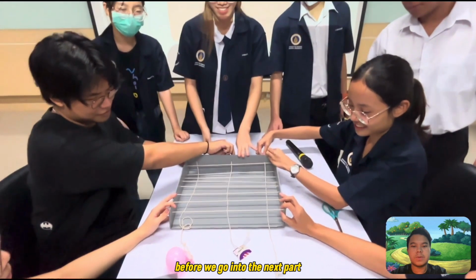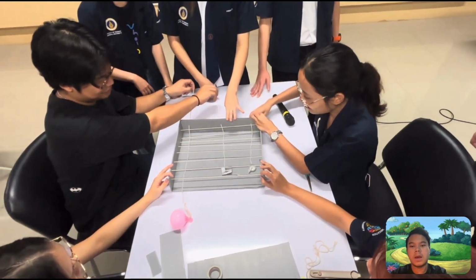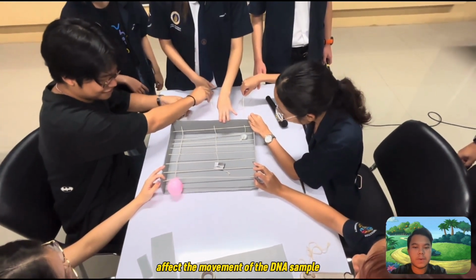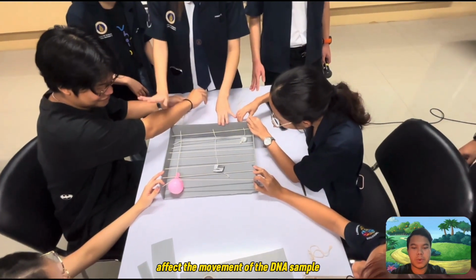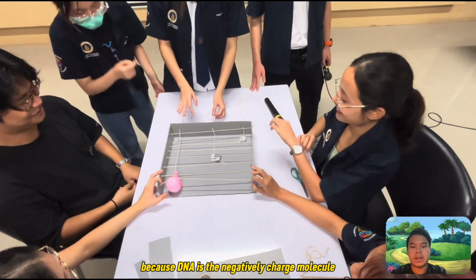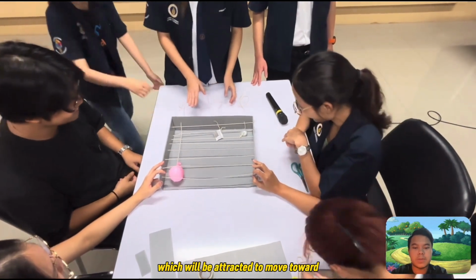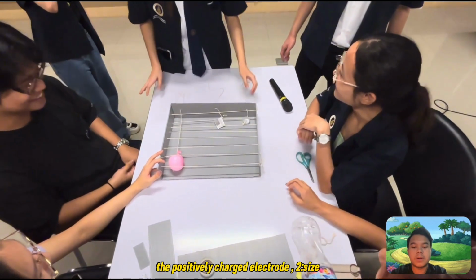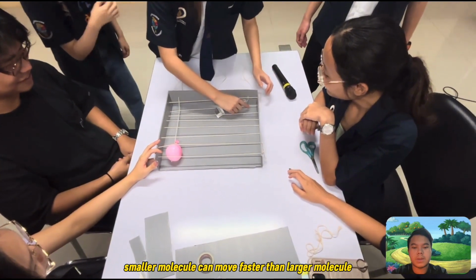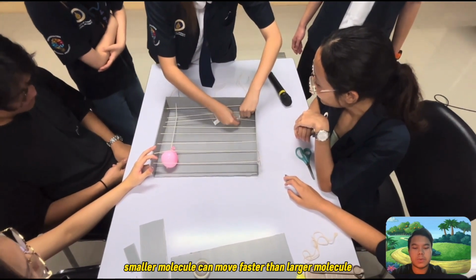Before we go into the next part, we want to sum up a little bit. In gel electrophoresis, there are 2 main factors that affect the movement of the DNA sample. These are: 1. Charge, because DNA is a negatively charged molecule, which will be attracted to move toward the positively charged electrode. 2. Size, smaller molecules can move faster than larger molecules.